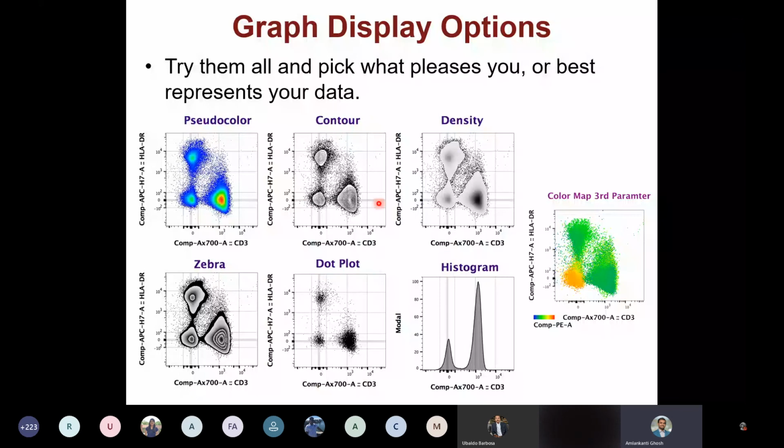In contour you see the central tendency of that highest antigen density population, and then as you go to the periphery, it dies down. And these guys, what you see here, I can call outliers. They're not really part of that population per se in terms of the MFI of the antigen expression, but they're just lying on the edges. Yeah, that is what I can interpret.